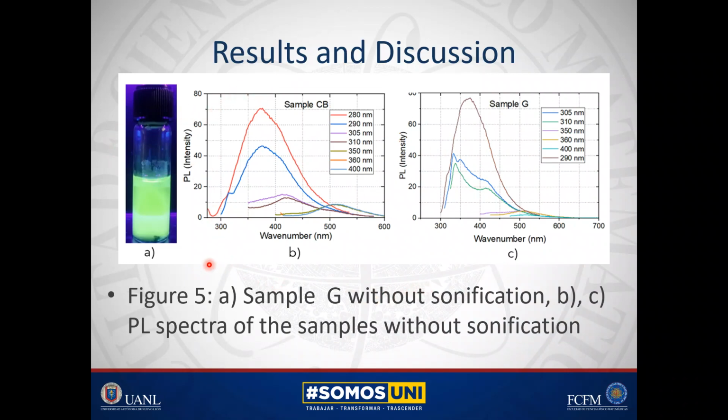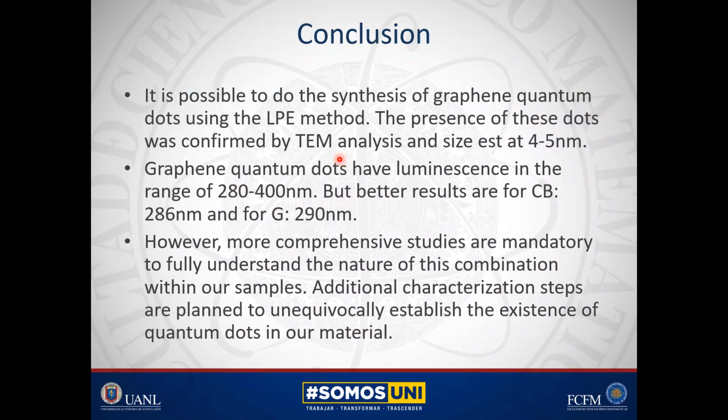Finally, we studied the samples without sonification. We can see that as we move the excitation wavelength, we get a different PL intensity. This is a characteristic that is very common in the carbon quantum dots and graphene quantum dots.